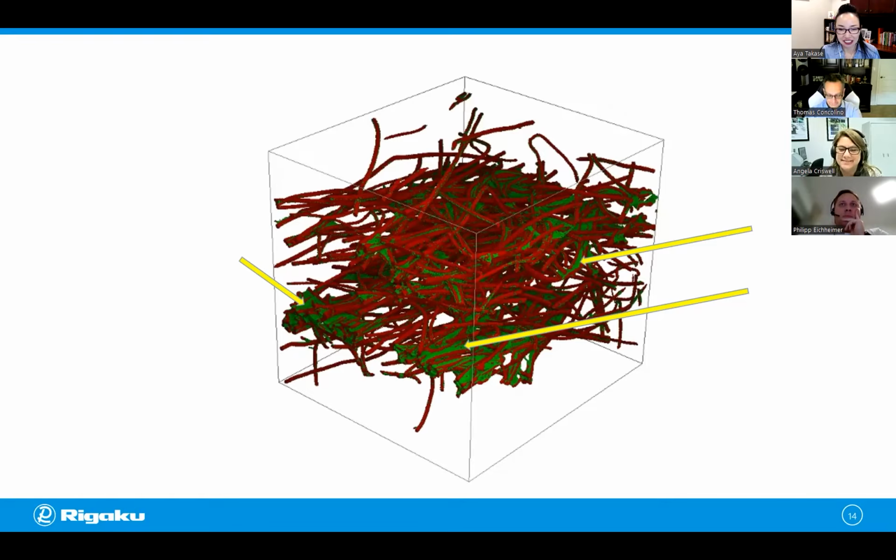And let me share the results. So this one, overwhelmingly, most of you chose true. And in the case of our filter media, all of these are absolutely true. So it's gonna add mechanical strength. It's actually going to catch some of these particles or contaminants that we want to filter out or catch.